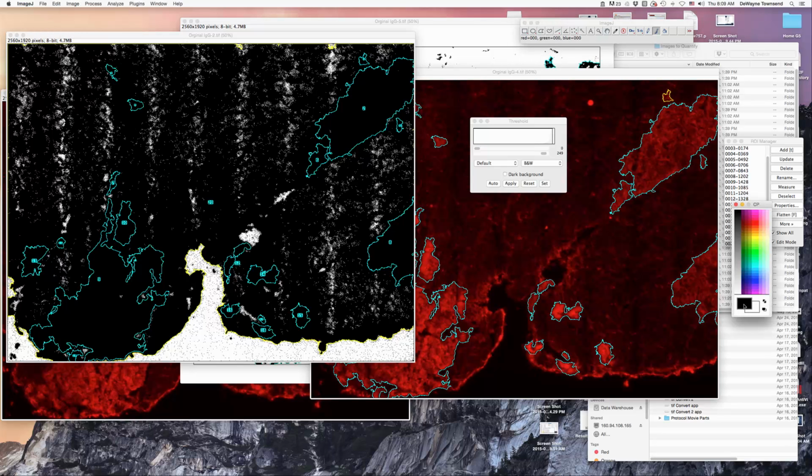Okay, I'm going to go back to the black brush because I want to basically seal these off so that it doesn't think that there's anything to exclude up there, because the muscle goes all the way up to the top there. Okay, and then just to make life a little easier, I'm going to exclude these guys down here.